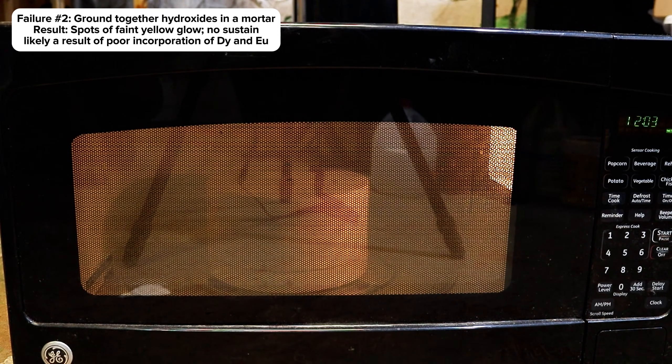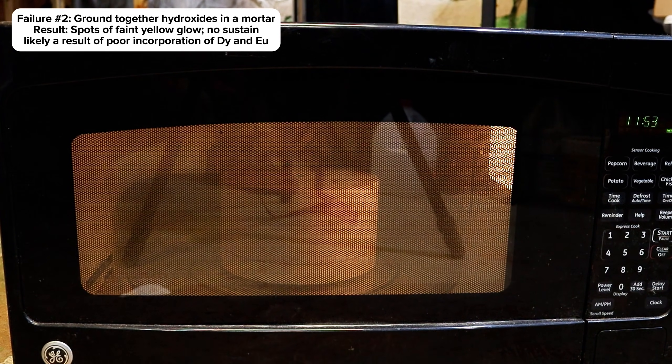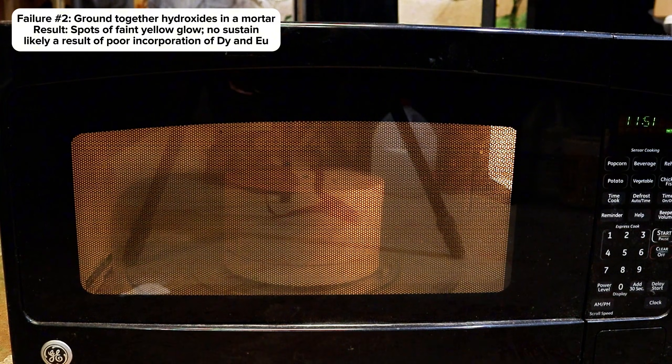The light it produced was also more yellow rather than the desired green, and didn't really sustain at all once the light source was removed. I figured that the non-uniform luminescence was a result of the doping agents not really being able to effectively combine with the strontium aluminate from simply grinding the 4 together.